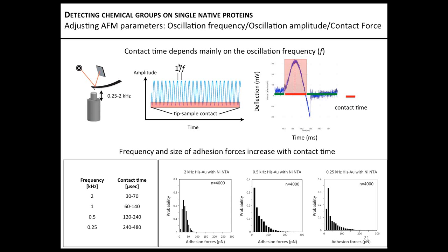So it's very difficult in this case to find a good probe that avoids too much drag force, and afterwards we need to use offline software to remove this drag force so that it's not displayed like an adhesion event. Okay. In general, as the conclusion, I would say that atomically flat surfaces are not required in that case to get the force profile.